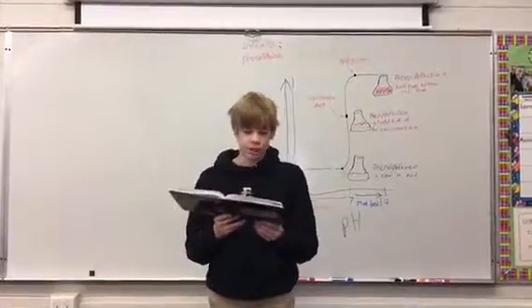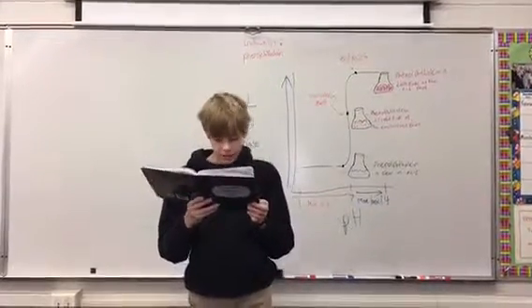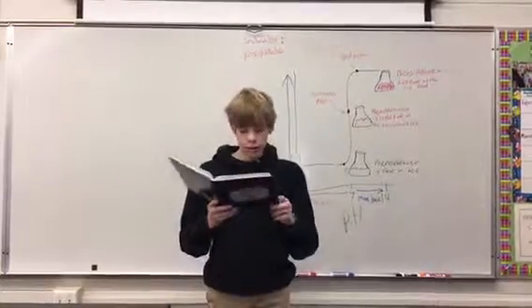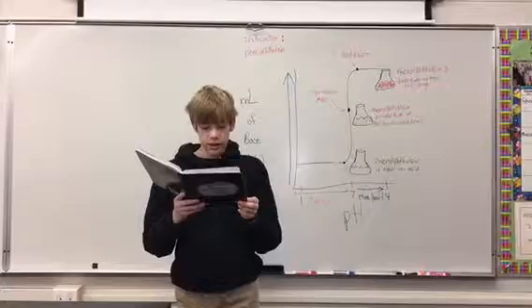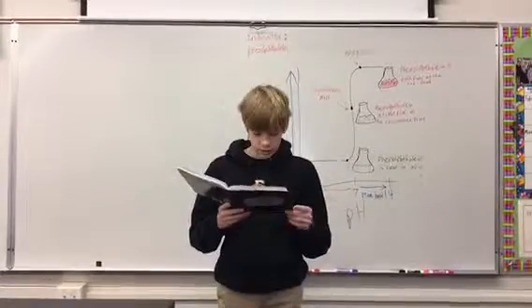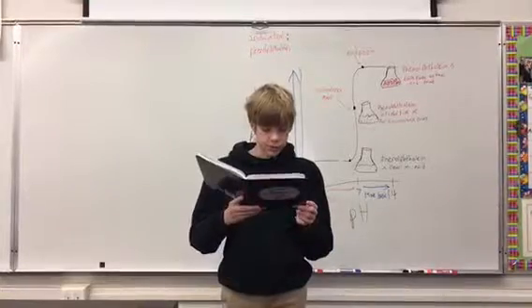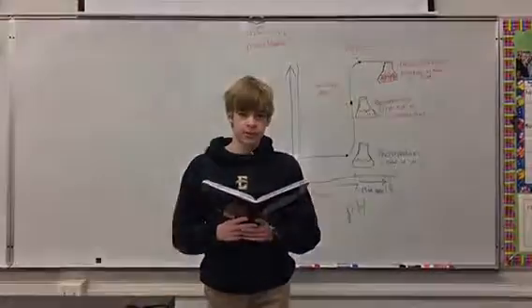Once the endpoint is reached, a person can find the volume of the base and the acid used in the titration. Using a series of dimensional analysis problems, the molarity of the unknown solution can be found using the volumes, concentration of base, and mole ratios from the balanced neutralization equation.